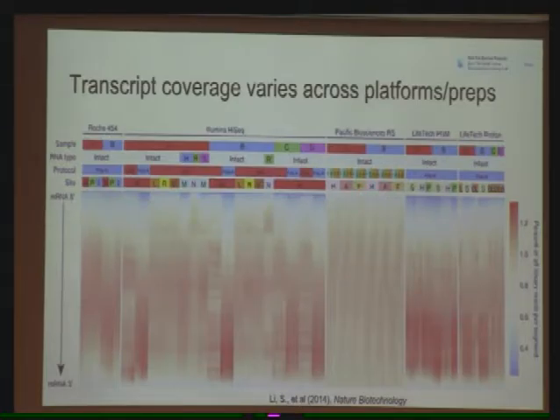But the idea with the PacBio is that you have a single molecule, and the enzyme, I could do this about 4 years ago. Is there anyone that's more familiar with the PacBio? You're working with a single molecule, and I think, is it fluorescing?